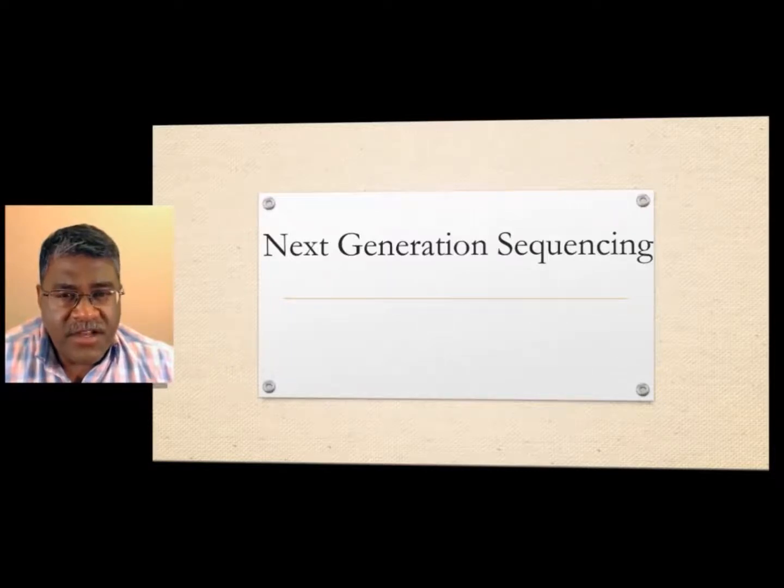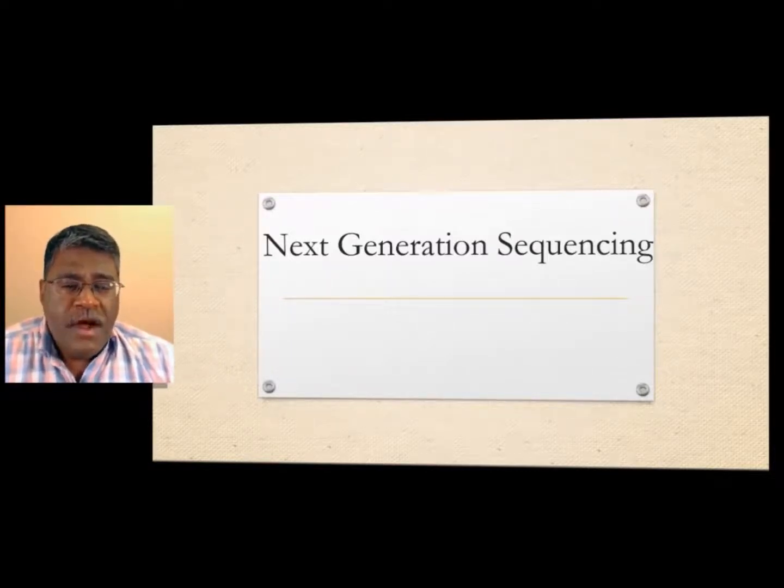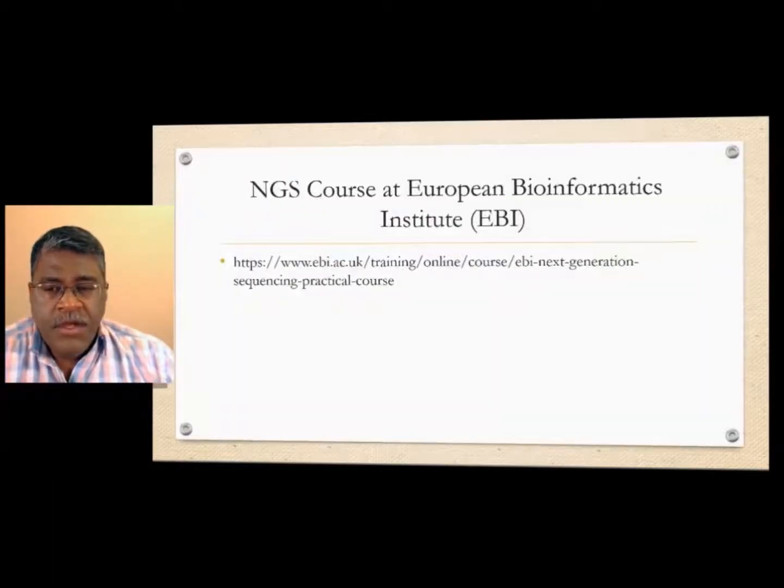And that has to do with the products of next generation sequencing. The experimental part is this data, and the processing of the data requires an incredible influx of bioinformatics effort. Right now, you would say high throughput methodologies is where the bulk of the bioinformatics effort is going.